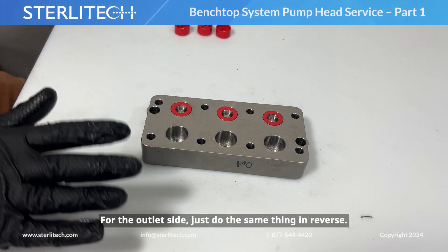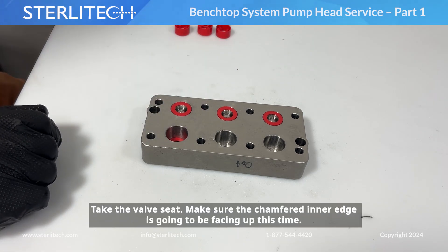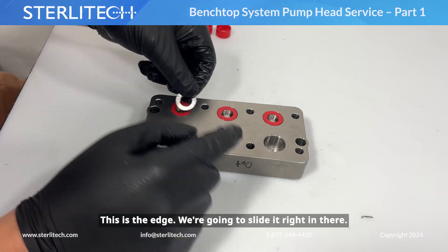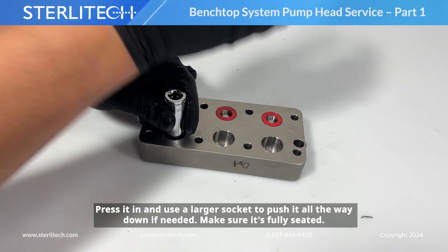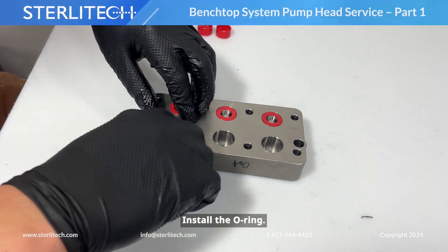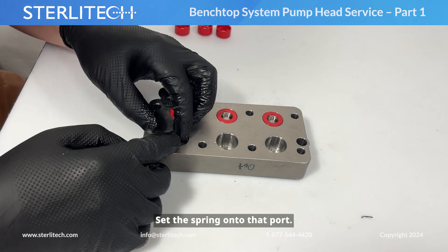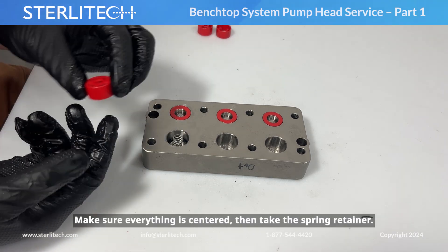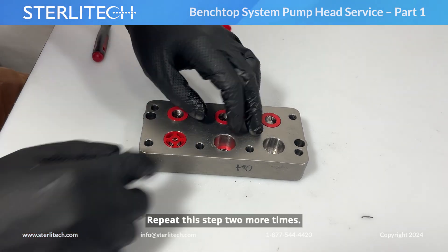Now for the outlet side, we're going to do the same thing in reverse. So we'll start with the washer — press that all the way to the bottom. We'll take our valve seat and make sure the chamfered inner edge is facing up this time. Slide it right in and press it in, using your larger socket to push it all the way down if needed. Then we're going to install the O-ring, set our valve poppet into the port, then set your spring onto that port. Make sure everything is centered. Finally, take your spring retainer and simply press that in over everything. Repeat this step two more times.